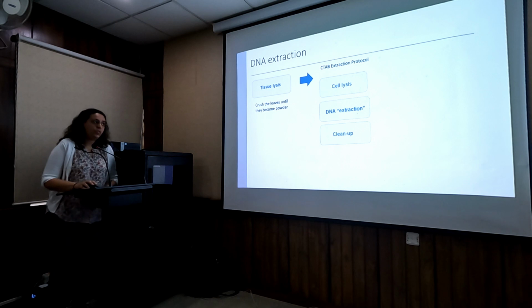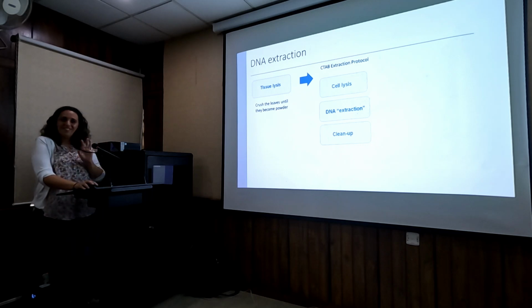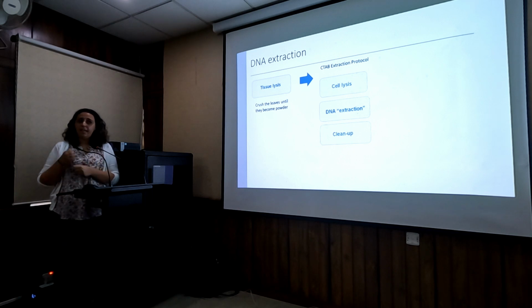fine. Okay, so once you've got your DNA extracted, well done. Then you think about, what do I want from my DNA for my project? And you can store that extracted DNA for months and take out little bits of it for the different projects to do different things, depending on the region that you want. And that could be even entire genome, or it could be just small markers.